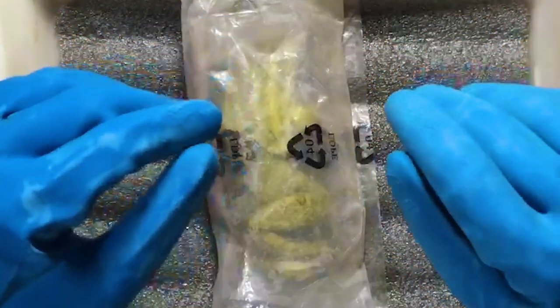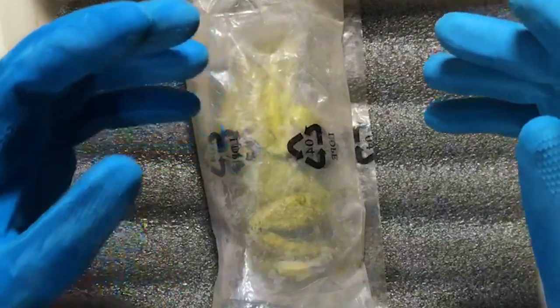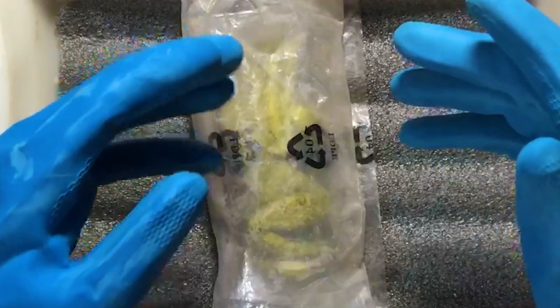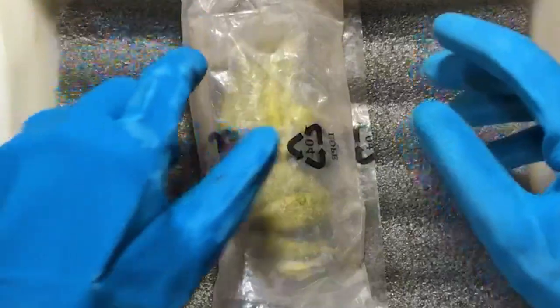On 30th July, I was returning from a walk and on the roadside I found this yellow bullfrog. So I thought of dissecting and preserving it. Let's get into it.